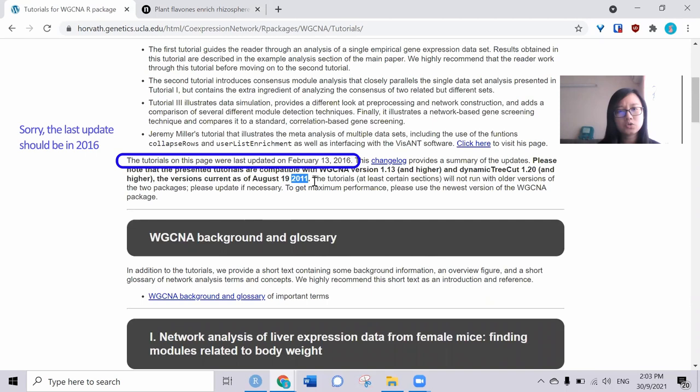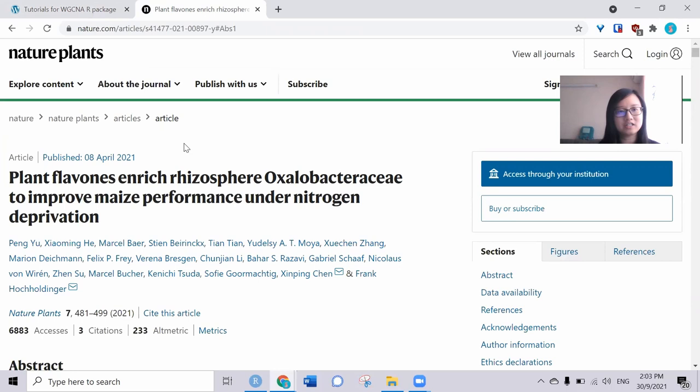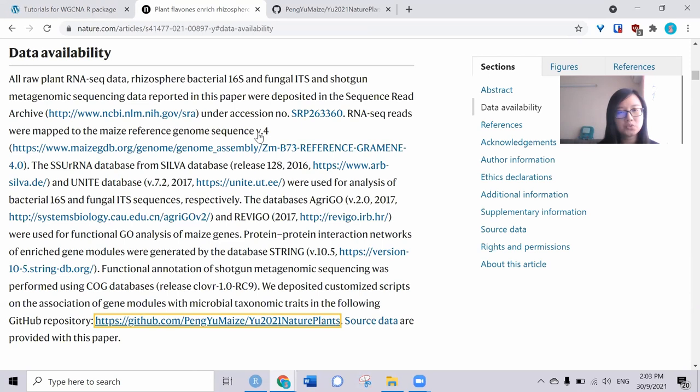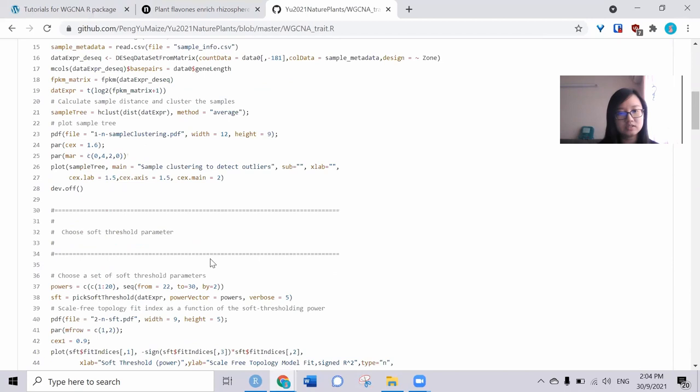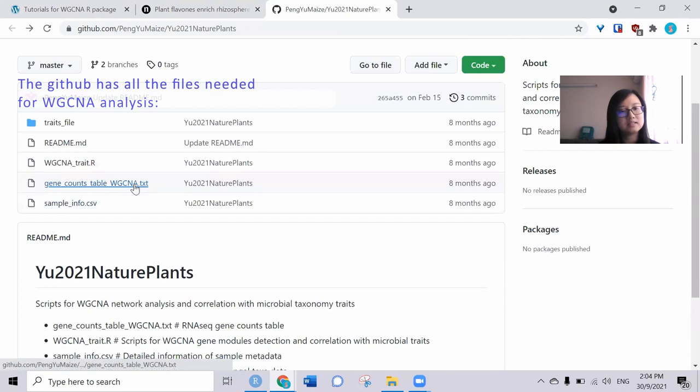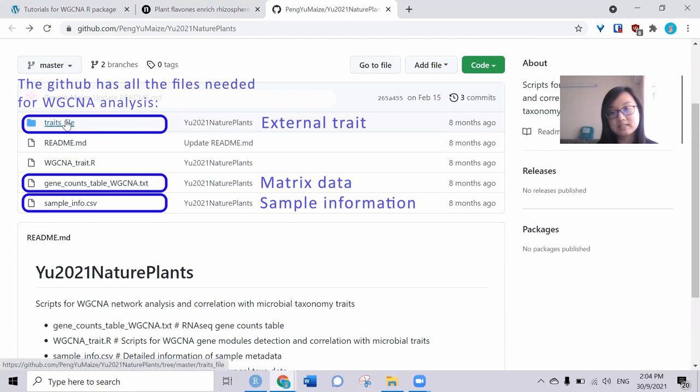The other day, I found a nice journal paper from Nature Plants. The authors are very kind - they deposited the R script in the data availability section. They put it into GitHub here, and the R script is all about WGCNA. They make it very neat, dividing them into several sections so we can follow accordingly. What's more, they also provided the gene count table, sample information, and trait file, which is the microbial data file.